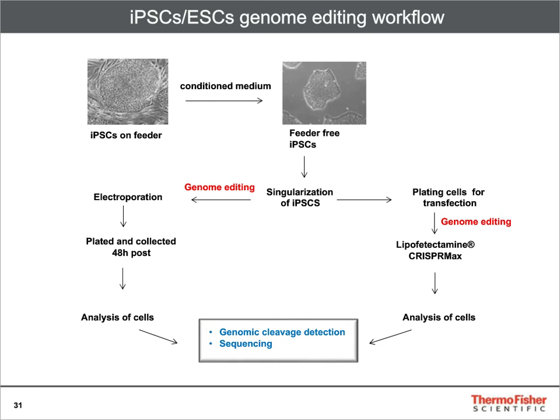genome editing. For electroporation, we use Neon, and one should first optimize Neon electroporation condition for maximum editing efficiency. For transfection, we use either MessengerMAX for mRNA or use CRISPRMAX for RNP-mediated genome editing. We analyze cells 72 hours post-transfection by genomic cleavage detection assay or by sequencing.